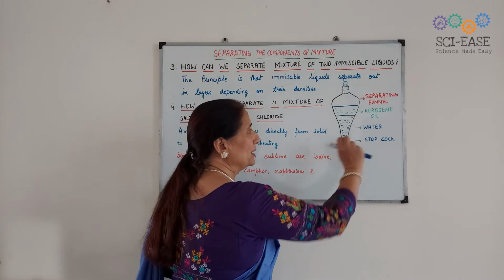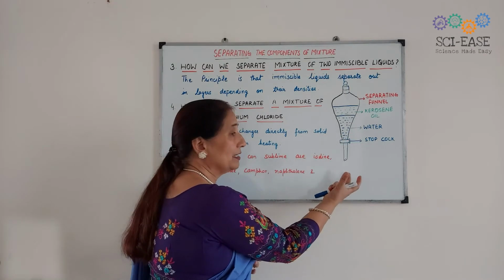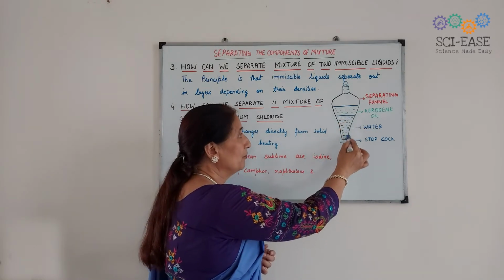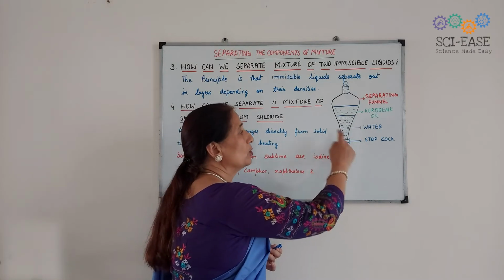So you will open this stopcock and start collecting water in one beaker, and when all the water has been taken in the beaker, immediately close the stopcock.